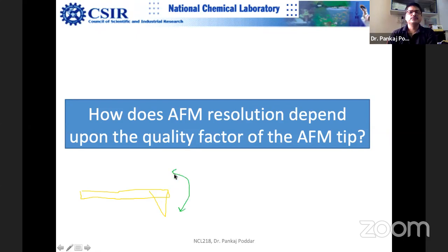Okay, because of the temperature kBT. Now, this is called its resonance frequency, F0, the free resonance frequency; there's one free amplitude and free frequency. If you plot it here, this peak will look more like a Gaussian peak.